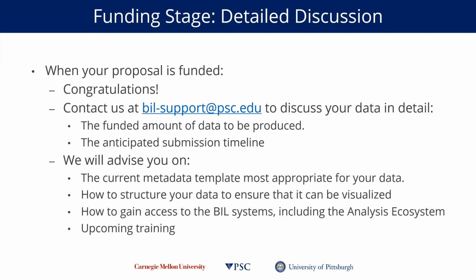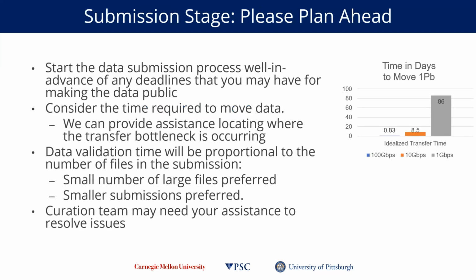Importantly, we will advise on how to structure your data to ensure that it can be visualized through our on-demand transformer system. And we also can give you more exact instructions on how to gain access to the BIL systems, including our analysis ecosystem, as well as any online upcoming training that we are offering.